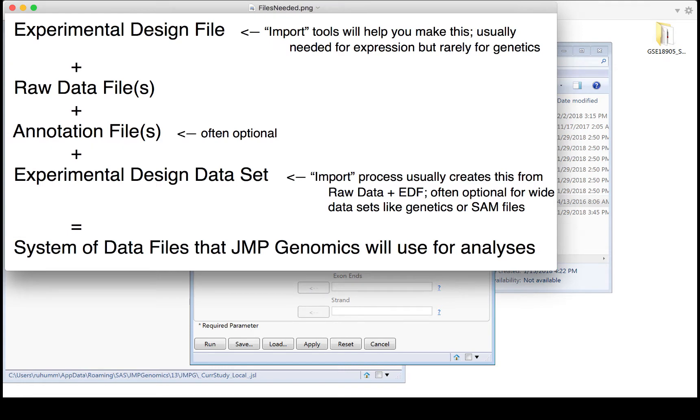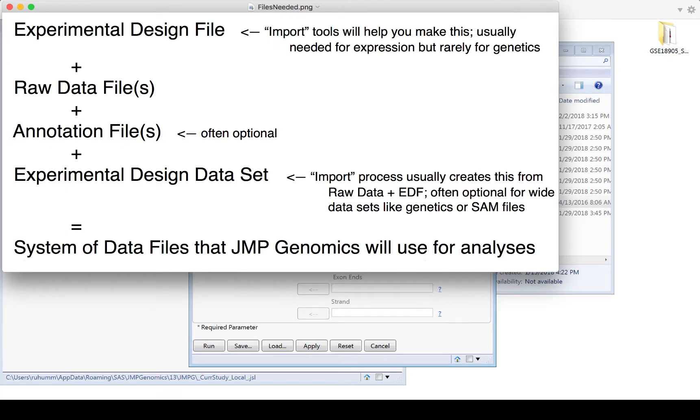So again, you'll often need an experimental design file, at least for expression data, and there are some tools in the import menu that can help you create this from your raw data files. Note though that most genetics data can be read in from a text file or VCF file without the need for the experimental design file. So it will be common for expression data to use an experimental design file and rare for genetics data to require that file.